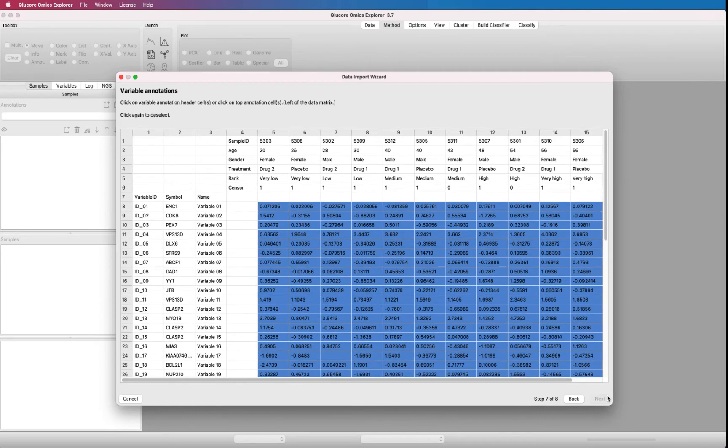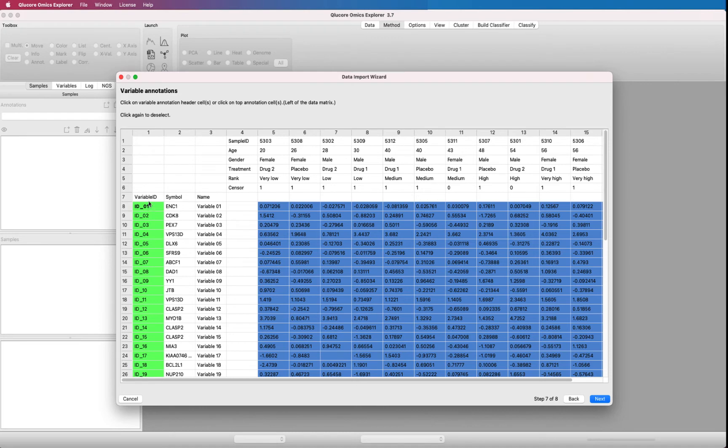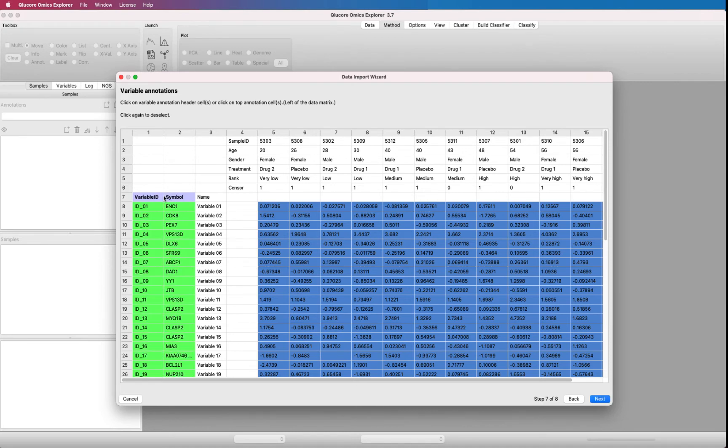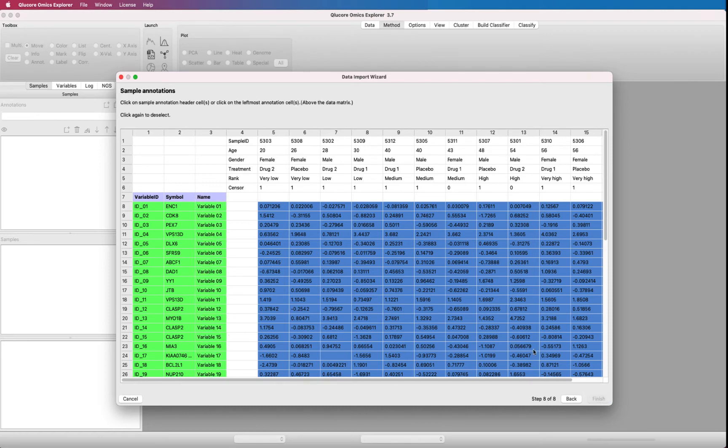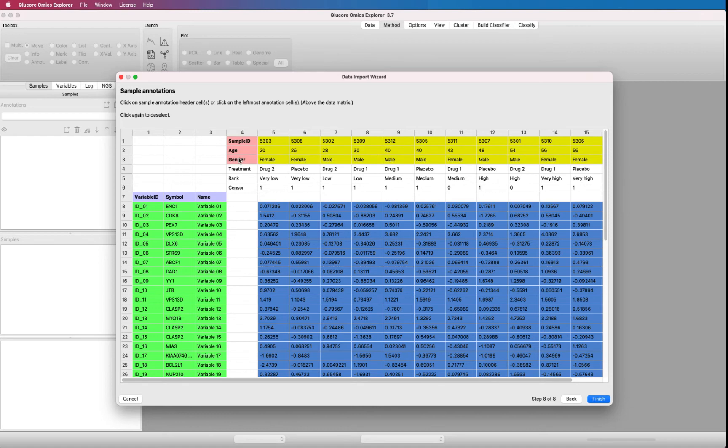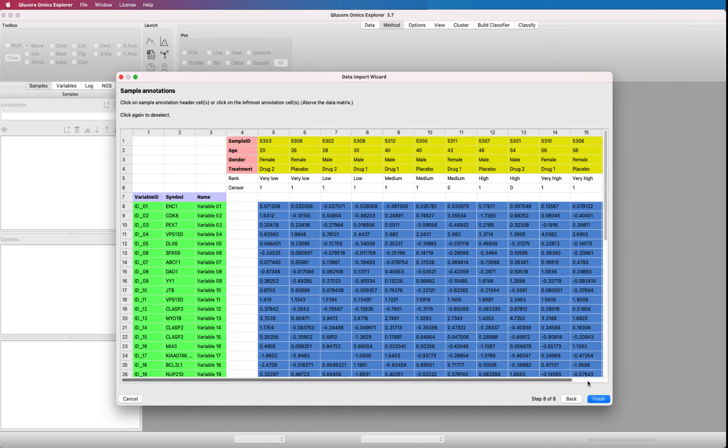Select variable annotation headers. If you select the wrong cell, just click on it again to undo. Press next. Select sample annotation headers. Note that you're not forced to import all roles with sample annotations. We have now defined the three main parts of the file. Sample information, variable information, and the measured data. Press finish.